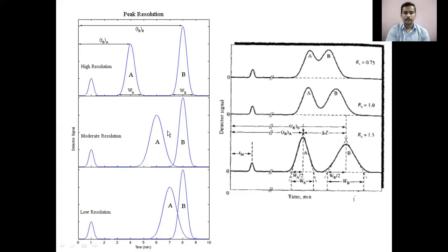If you look at here, the degree of overlapping has been somewhat reduced in this particular chromatogram. There is a peak separation.